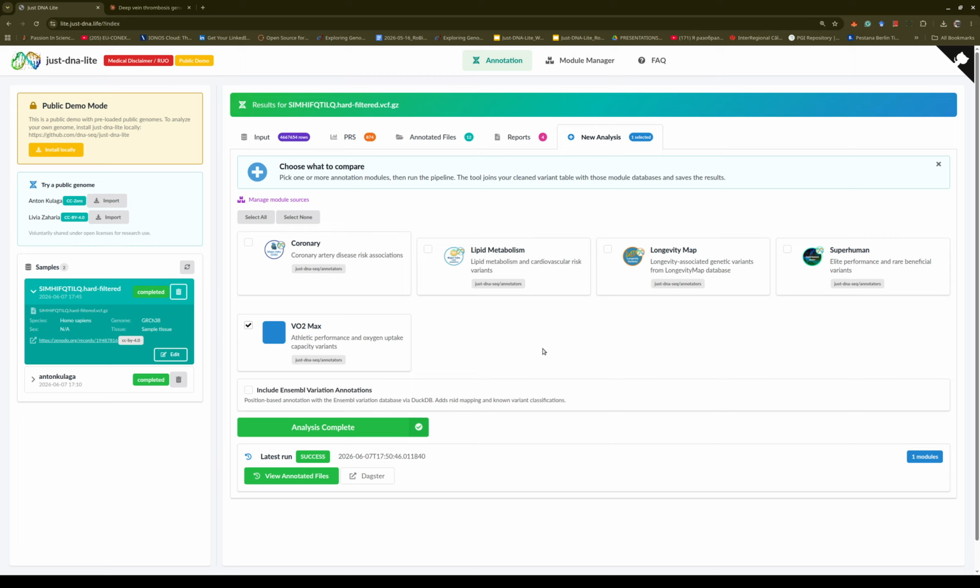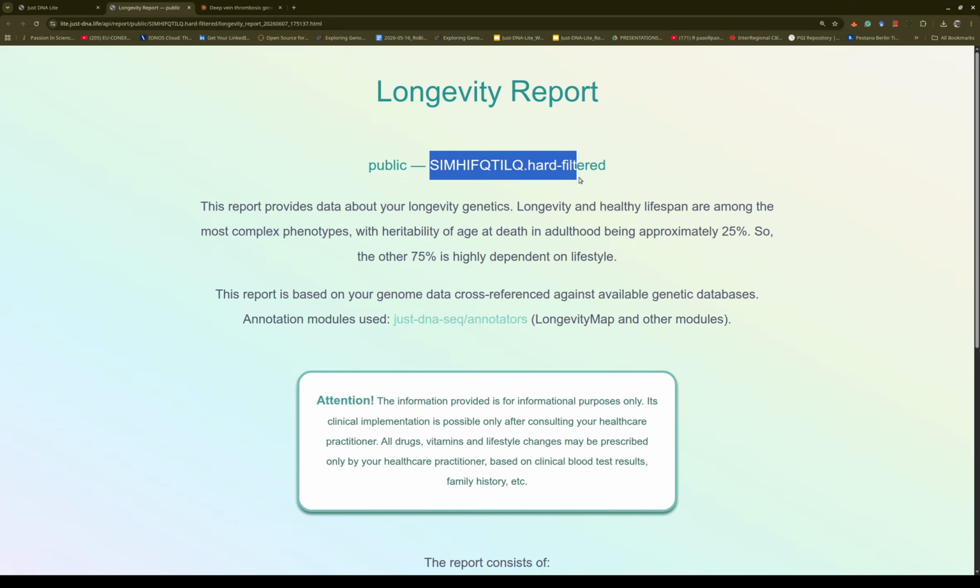And it seems that our analysis is complete. If you go to reports, we have the fifth report, and we can click on view here. You can see first from what file it is produced, and let's see. So I have a wonderful net weight of -1.